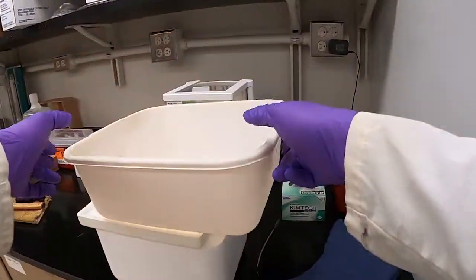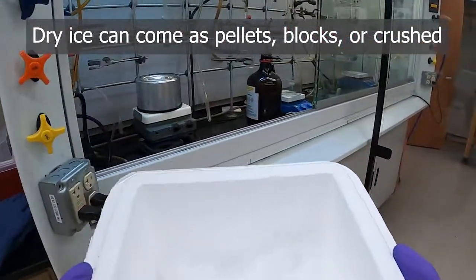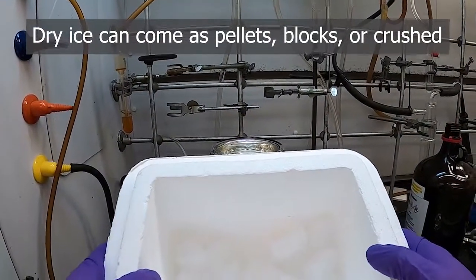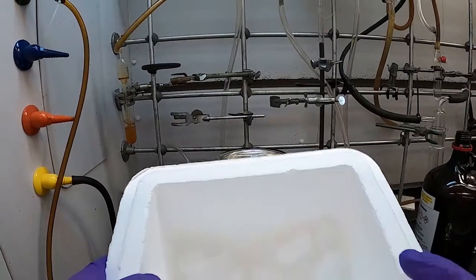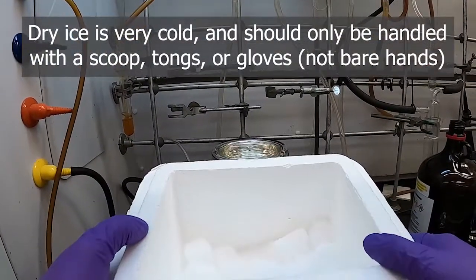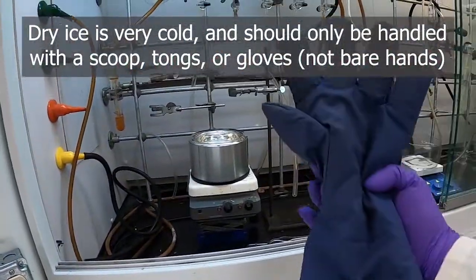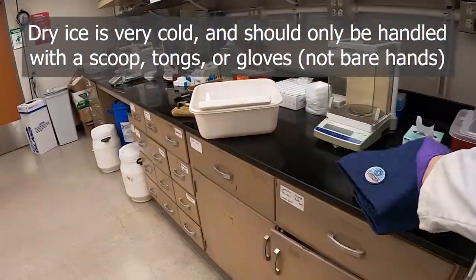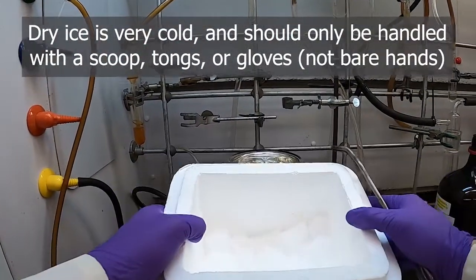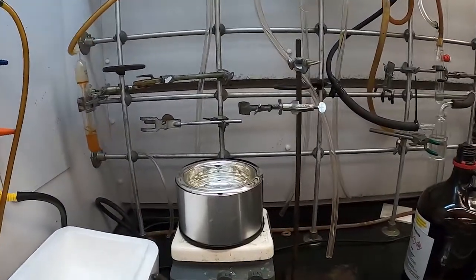And then to that we would add dry ice. Now dry ice can come in different forms. Sometimes you'll have pellets, sometimes you'll have large blocks. This was a block that I broke up with a hammer. You want to be careful with dry ice. You don't want to touch it with gloved hands for any amount of time, unless you have leather gloves or a cryo glove like this one. The better options are to use something like these kinds of tongs, which is what I'm going to use. So let's see if we can get our box of dry ice over there.